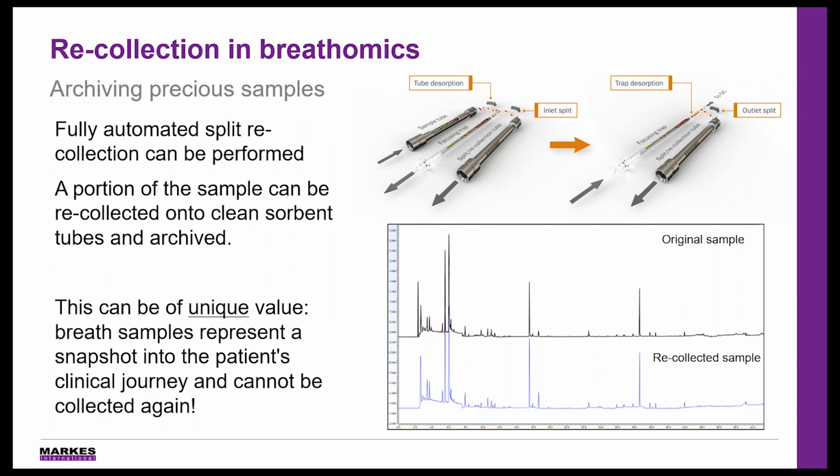This means none of the precious sample from patients who have volunteered their time is wasted, and provides the option to reanalyze the same sample, which is beneficial for several reasons, including validation of any future method developments, but also for peace of mind to safeguard any instrument issues, such as contamination, which would mean the result would be lost otherwise.